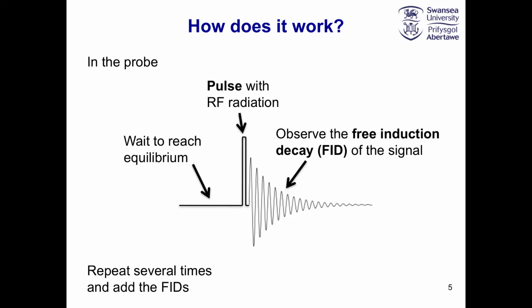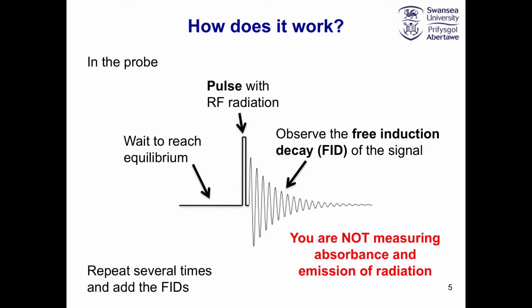The most important thing, though, to note is this. You are measuring resonance of the magnetic moments as they return to equilibrium following the pulse. You are not measuring absorbance or emission of radiation.